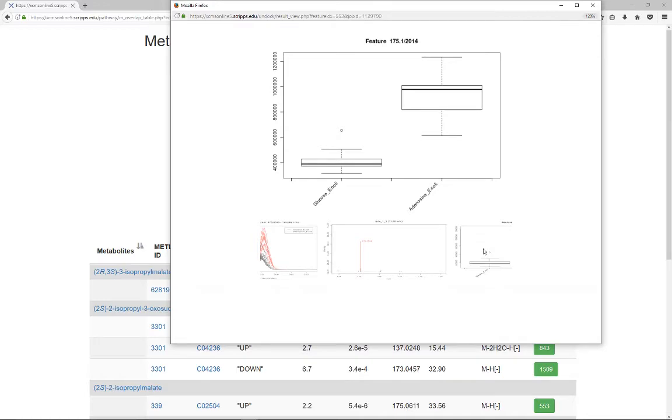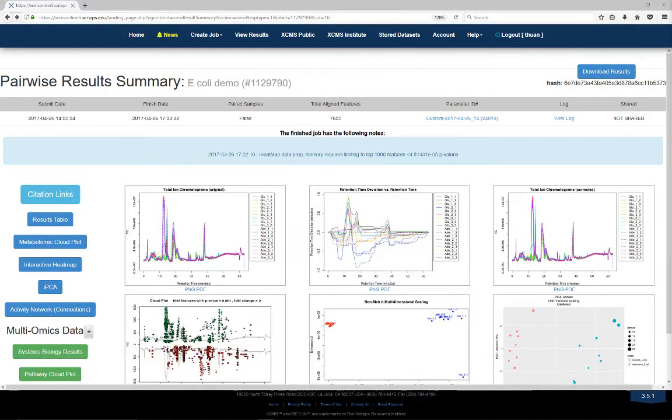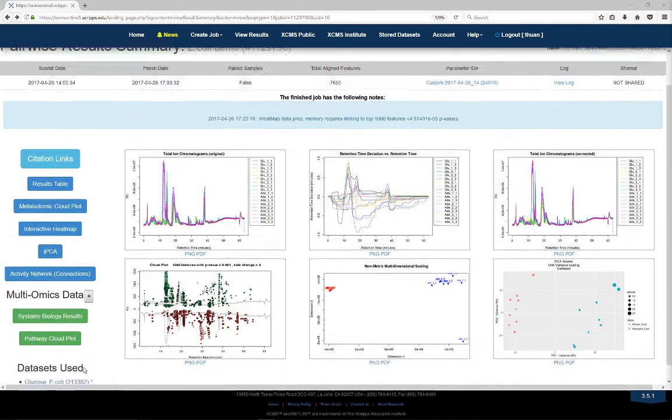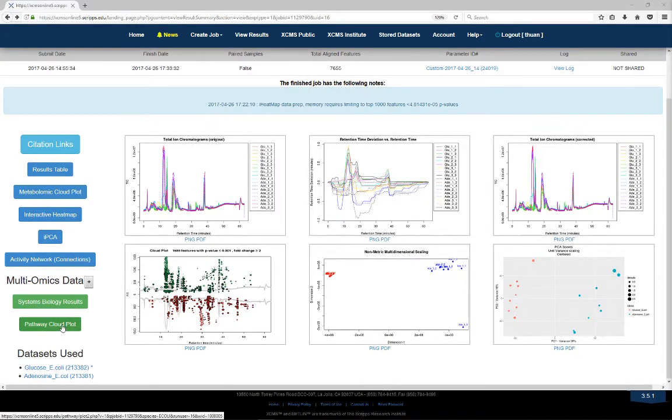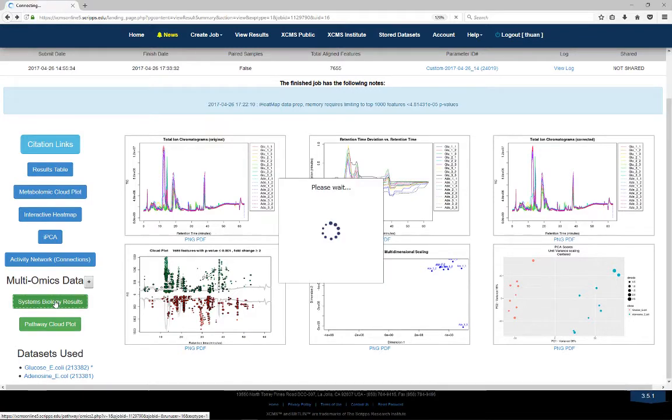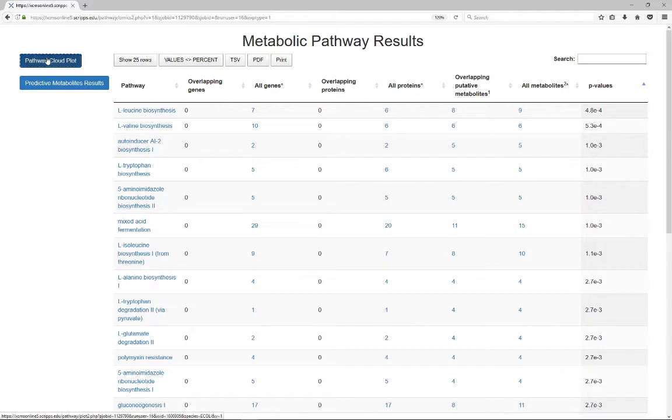We also provide a simple visualization tool called Pathway Cloud Plot. It can be accessed from either the job summary page underneath the systems biology results, or the upper left blue button inside the systems biology results.